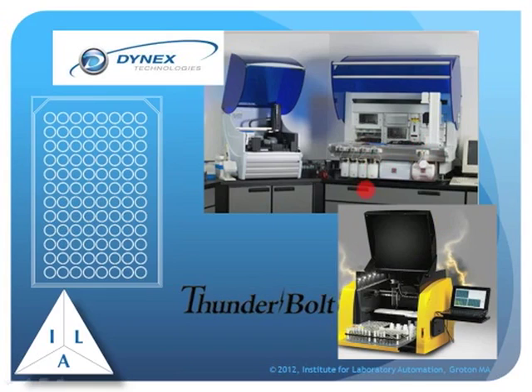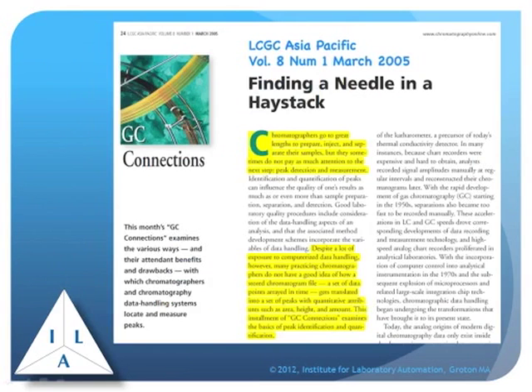And here, everything is done in one compact package. Prepare the initial samples, put them in, add the reagents, and the machine does all the work, including doing all the readings on the plates. So when we start talking about sample preparation and integrating systems, you don't have to have these things spread over the lab bench. If we've standardized properly, we can do it in fairly compact footprints.